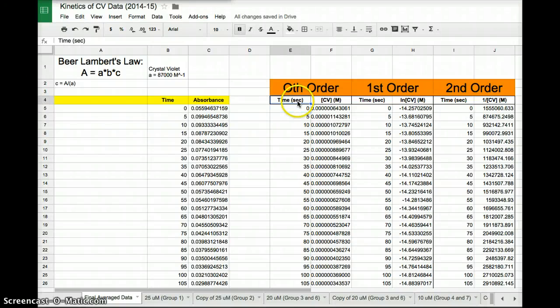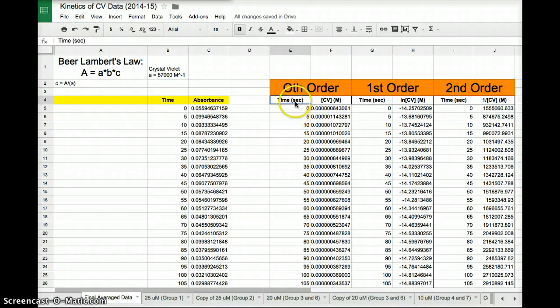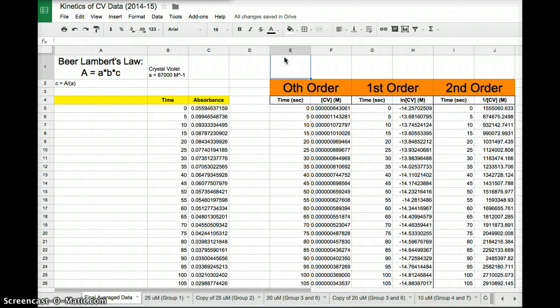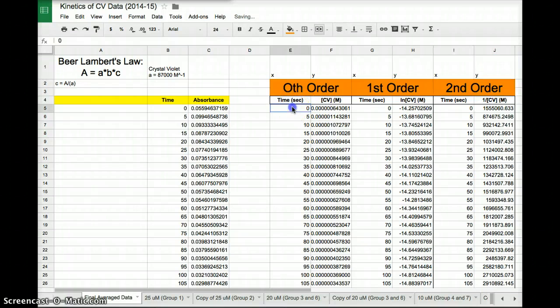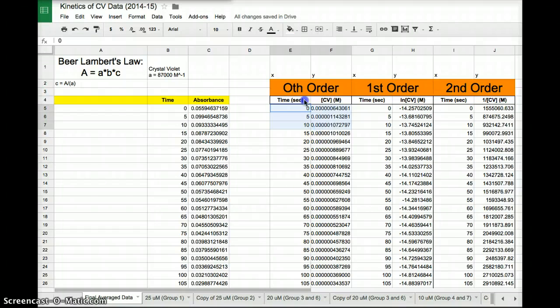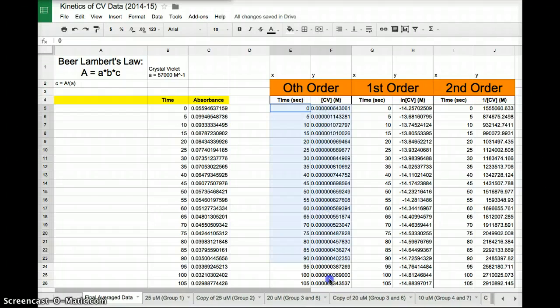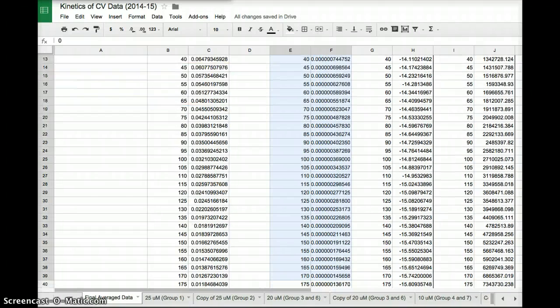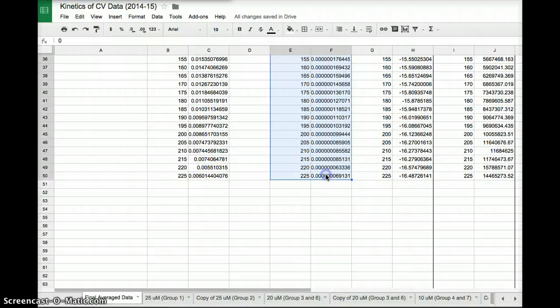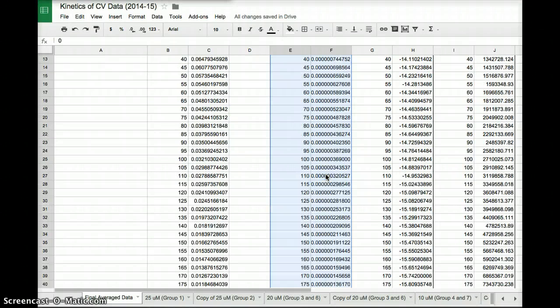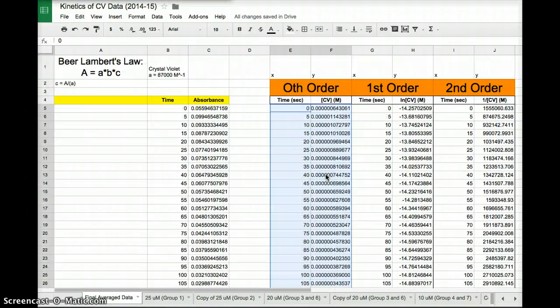Usually you put the x, what's ever in the x-axis, on the furthest most left column. And what's going to go in the y, so this is kind of like our x, and this is going to be our y for each of these. We always want time on the x-axis. And I highlight all the data. So to make a zeroth order graph, that's concentration versus time, I'm going to highlight all the data. So I click it down. It's all highlighted. You can see that box highlights it all.